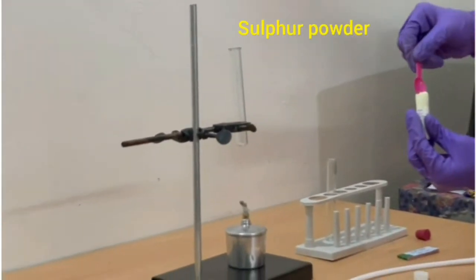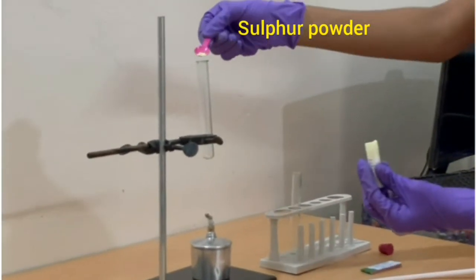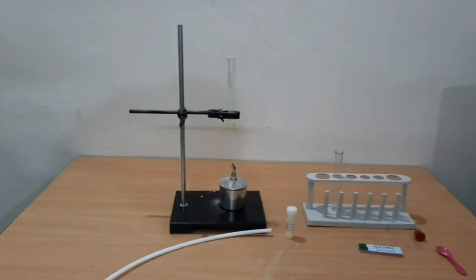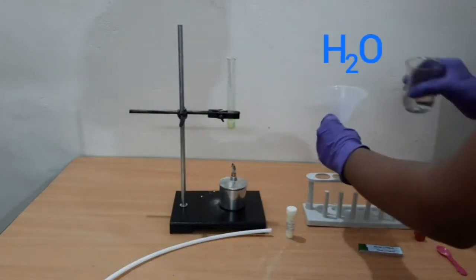Take 5 grams of sulfur powder in a test tube. Take a little water in the other test tube.